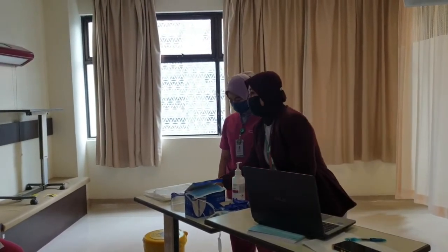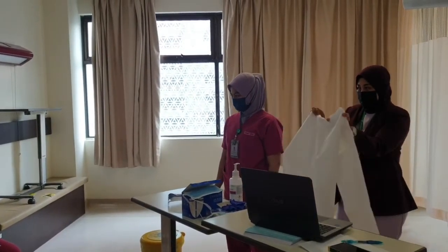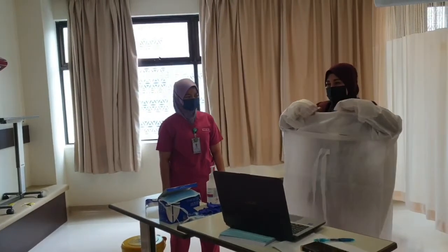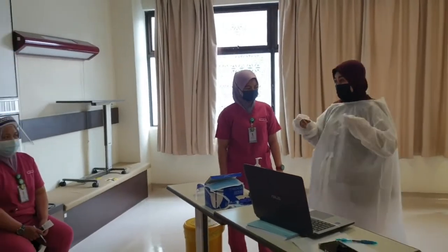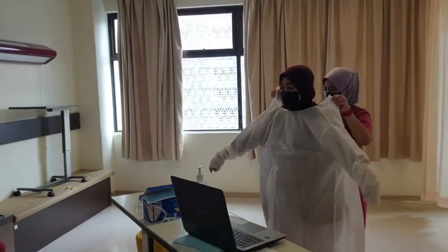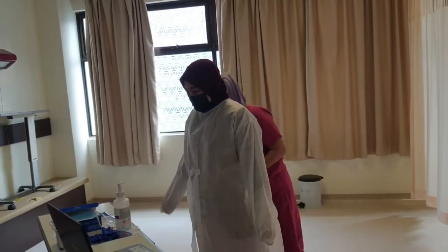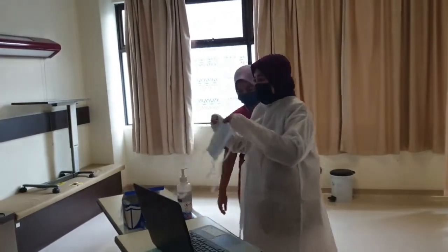So now we go to the gown. If you cannot do it alone, you can have an assistant. You need to fasten everything. And then we use the mask.